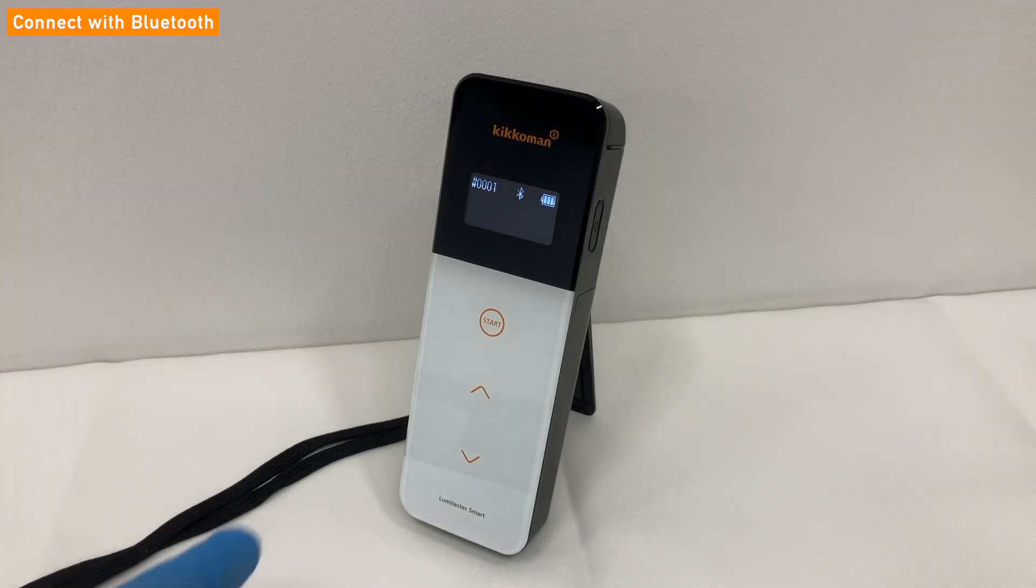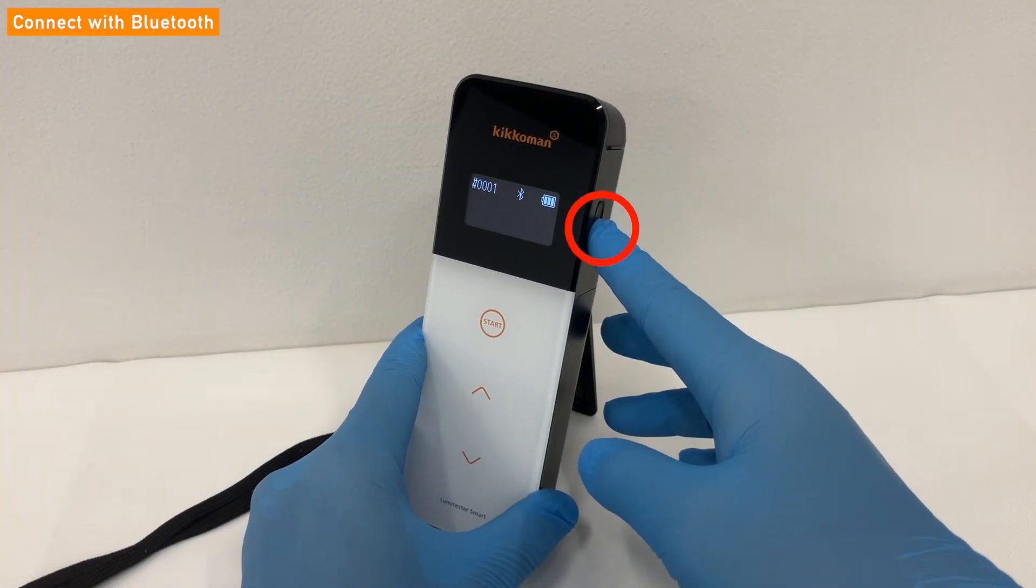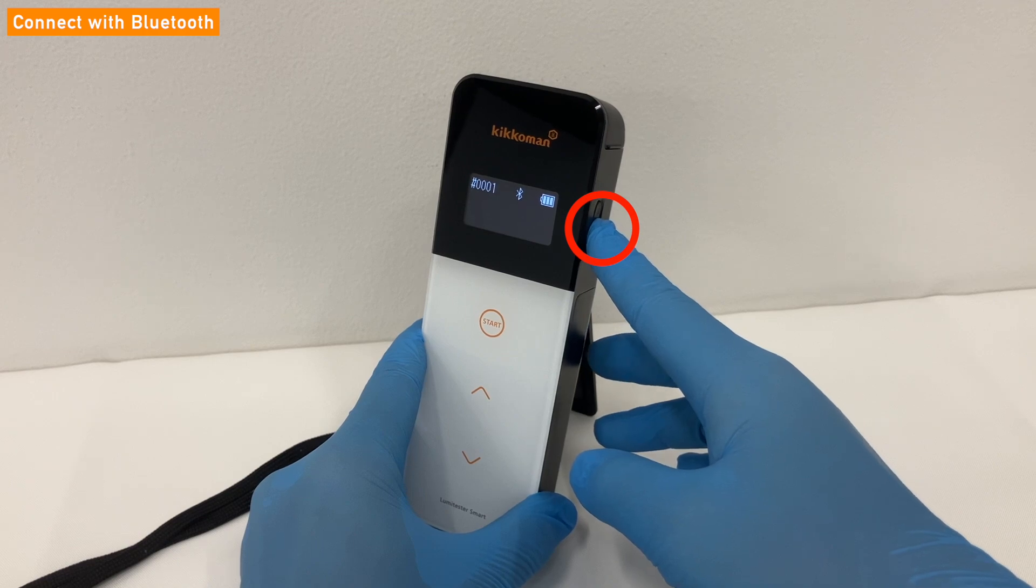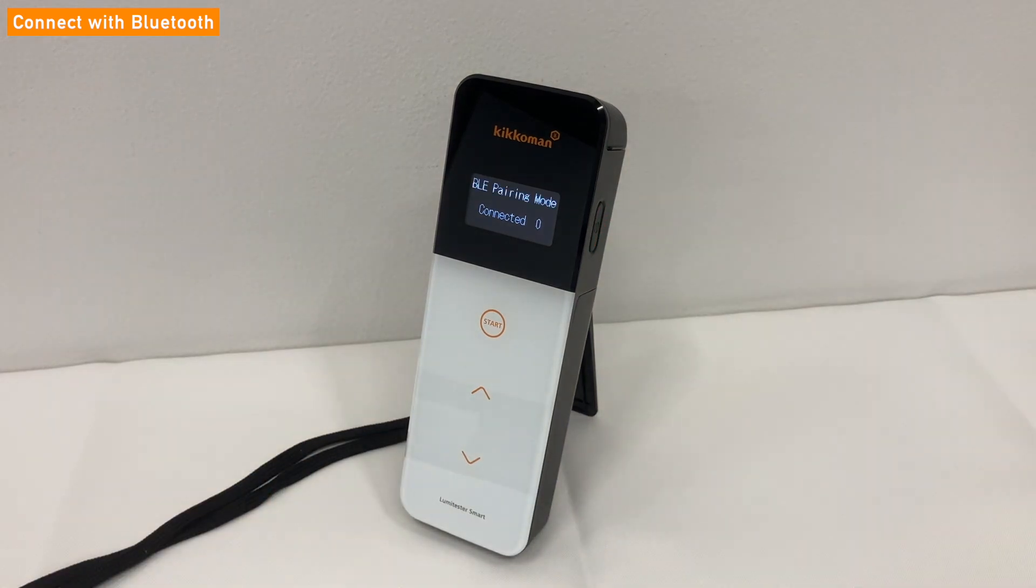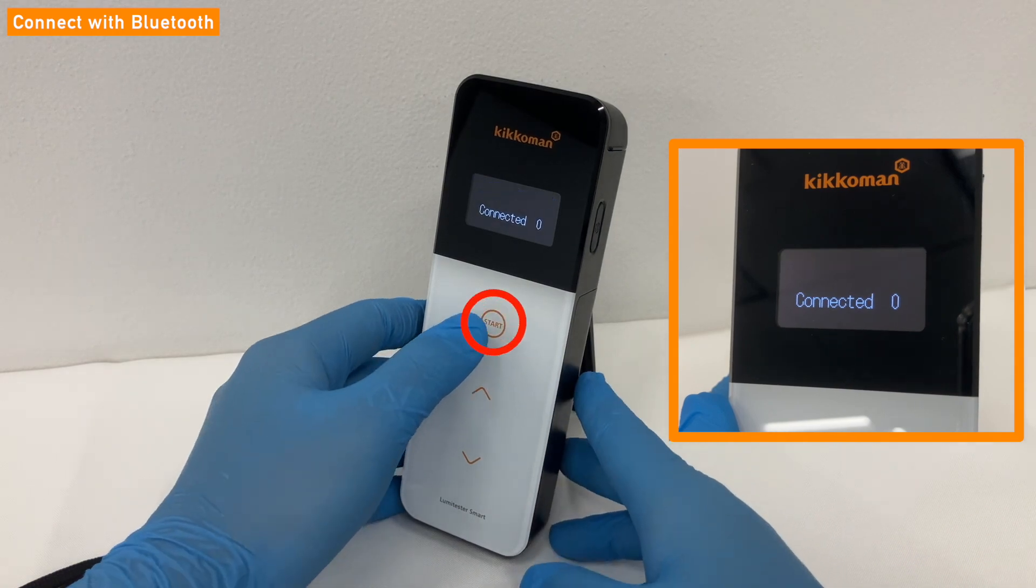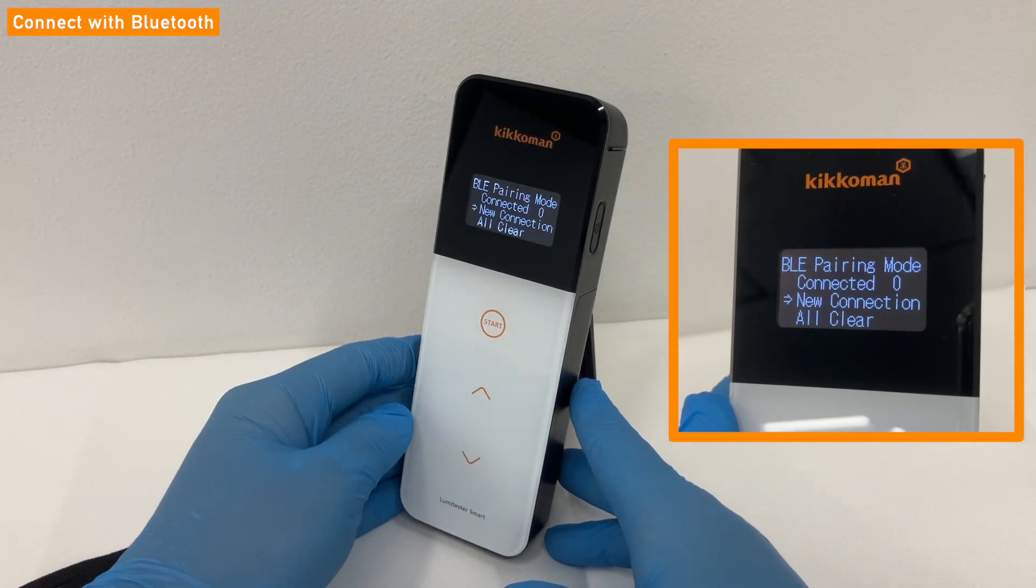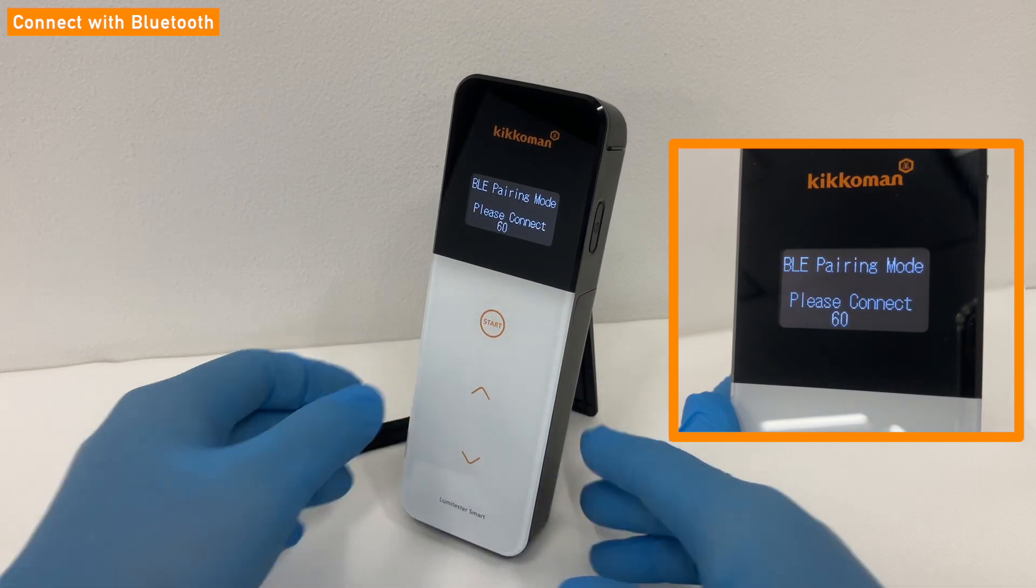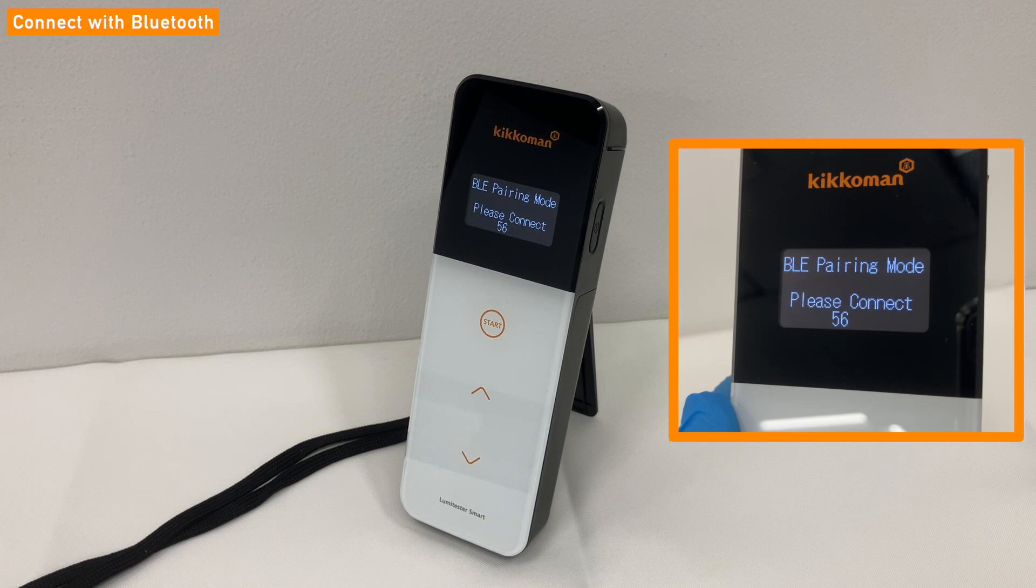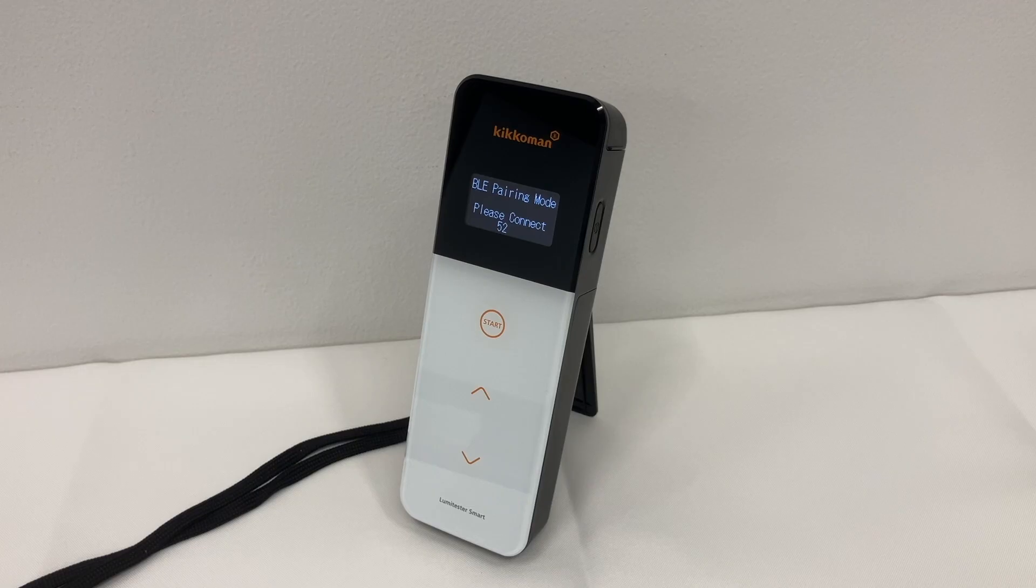Turn on the Lumetester smart, press and hold the power button on the side for at least five seconds to go to the settings screen of Lumetester smart. Next, select New connection when BLE pairing mode is displayed on the screen. Then a 60 seconds countdown will begin. Please operate the app according to the steps we are going to introduce until the countdown ends.